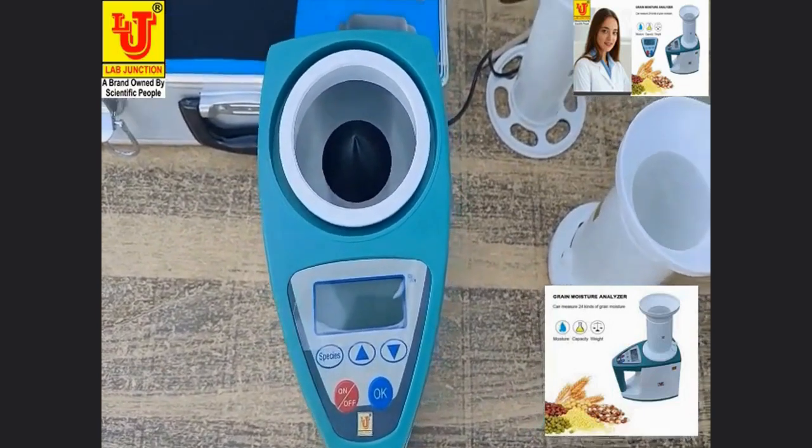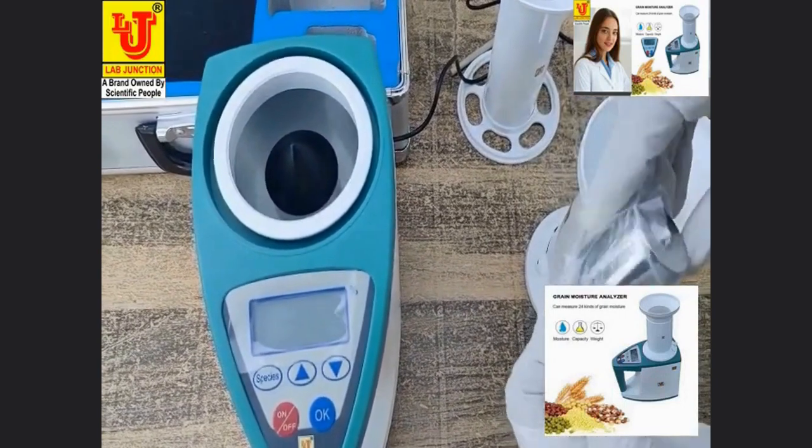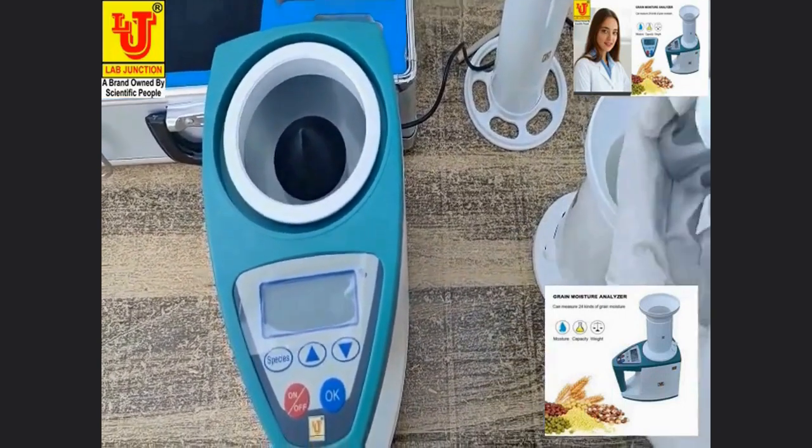This is the weight of 200 grams, used for calibration.